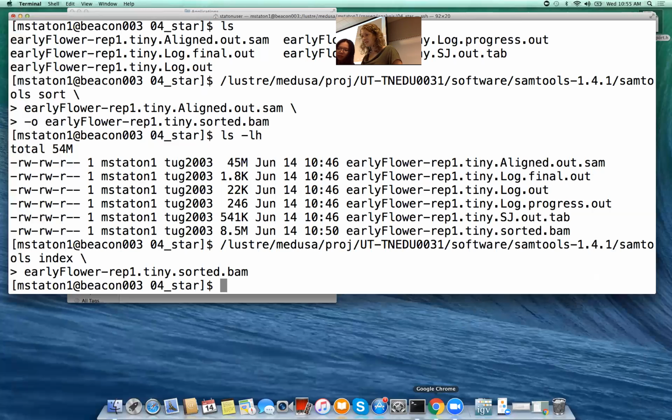What's this? I think those are S. I don't actually know what those are. I tested on the large files and it worked fine. I see peaks. Maybe there's just nothing in this region. I didn't test this tiny file. I don't see any reads. I don't know what's wrong.